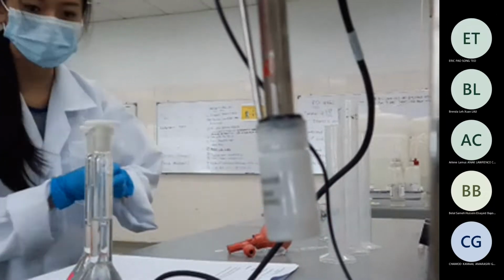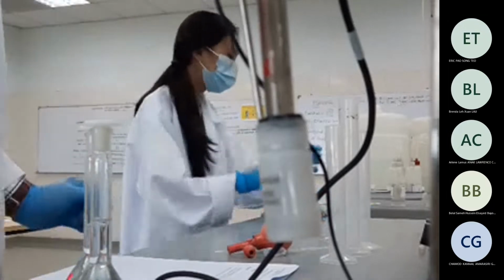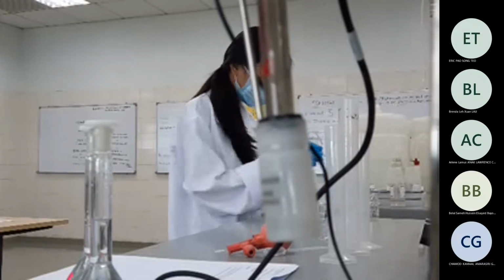Done? I mean, have you rinsed it with the distilled water, this one? Enough. Just try to make sure that it touches everywhere or as much as possible, and then you can take the same water here because it is the rinsing, and then just discard the water. Done, Lynn? Done?